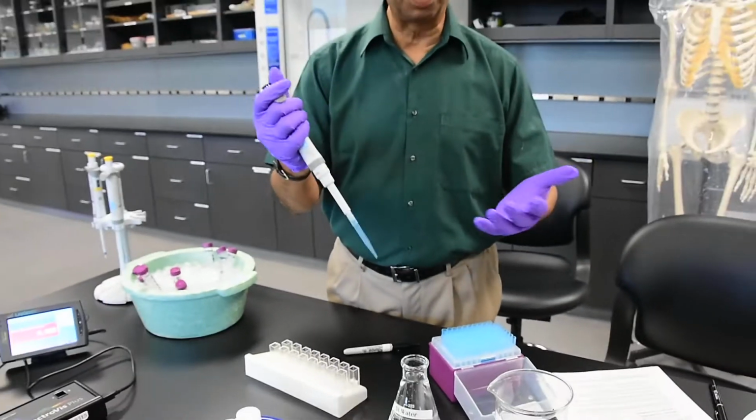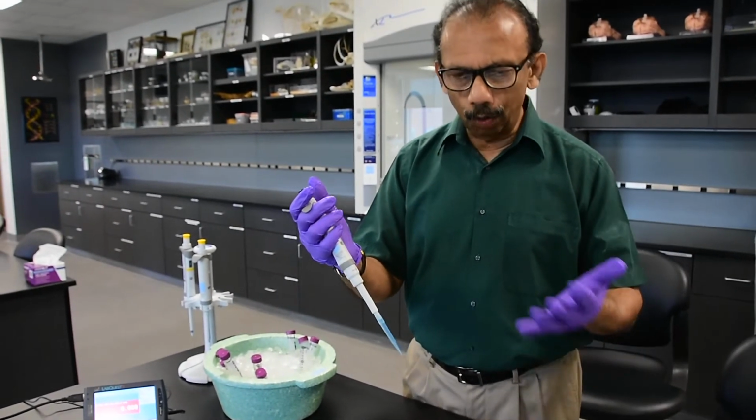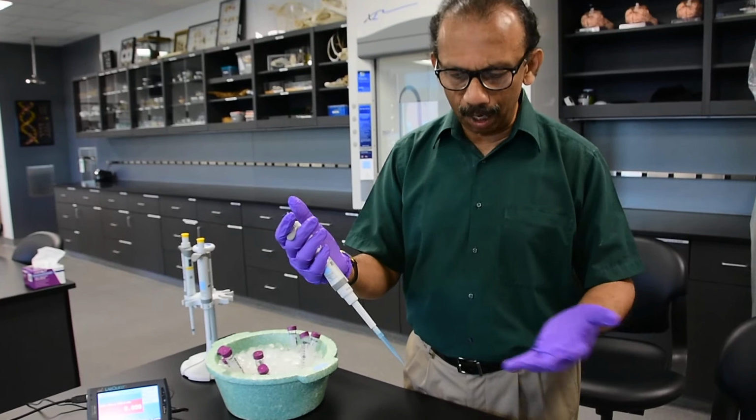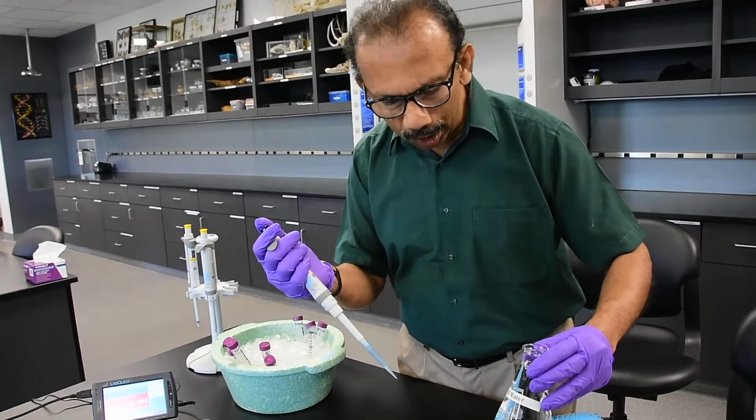Now I take a fresh tip. So this is something important. You want to change the tip as much as possible, and also wear gloves to avoid contamination of the enzyme or the reaction. Now I'm going to take distilled water.